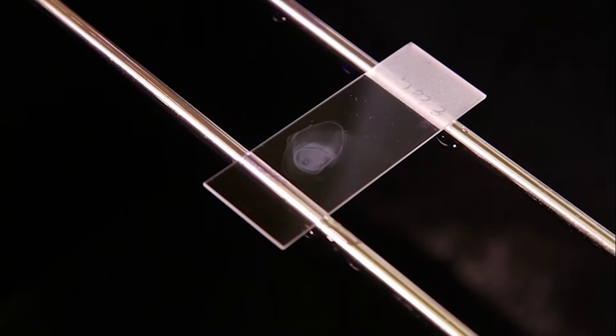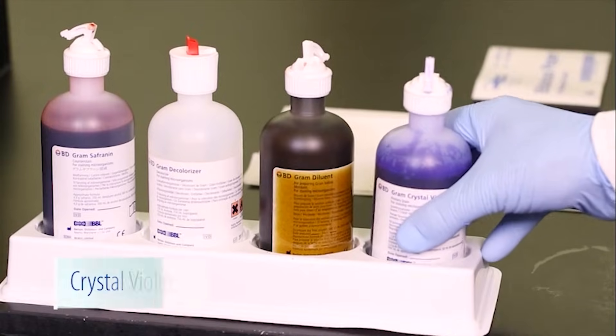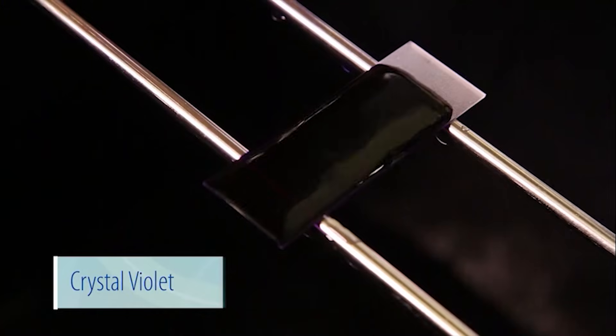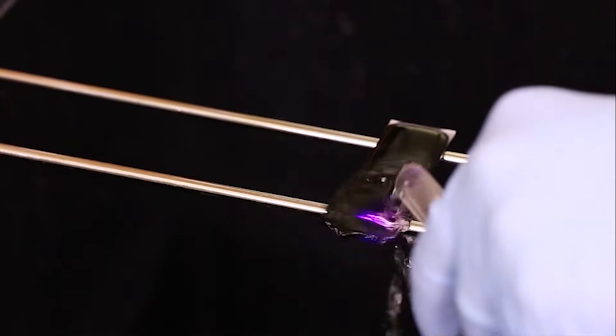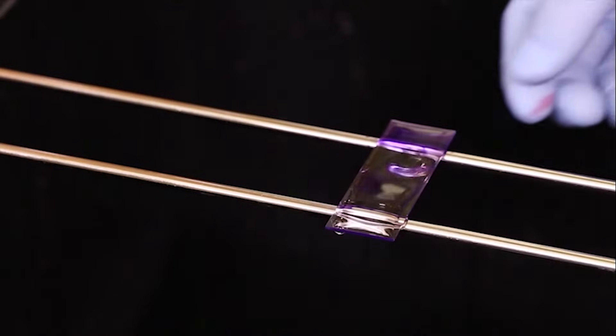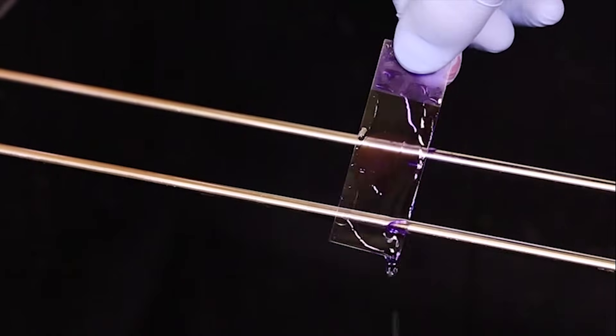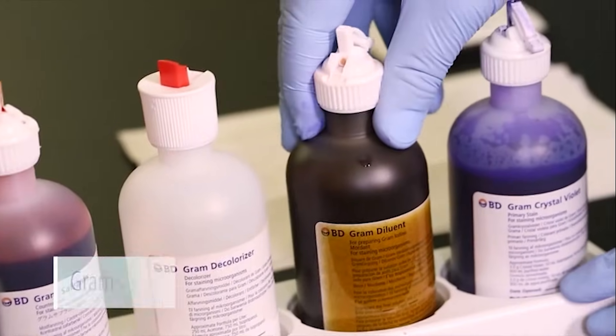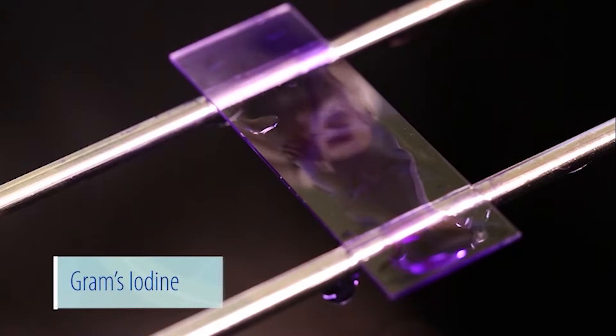Flood the slide with crystal violet. Wait at least 15 seconds, then gently rinse the slide with water. Tilt the slide to remove the excess water. Next, flood the slide with Gram's iodine.